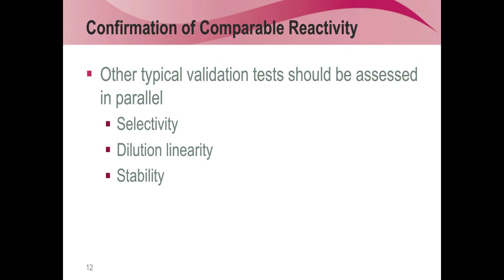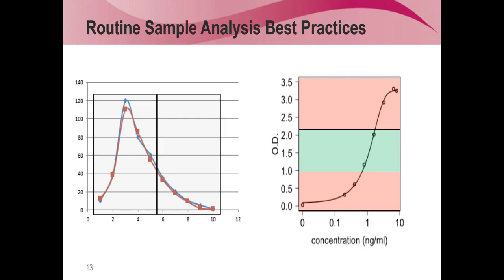And there's one thing when you, of course, now have validated your assay and you're moving away from the assay validation and into your study and into your clinical sample analysis, then you want to employ a few tricks. And for plate-based assays, this has a lot to do with how you essentially place or plan your daily work on the biosimilar and innovator samples. And we are usually blinded, so we have to basically do everything in a symmetrical way, so to speak.